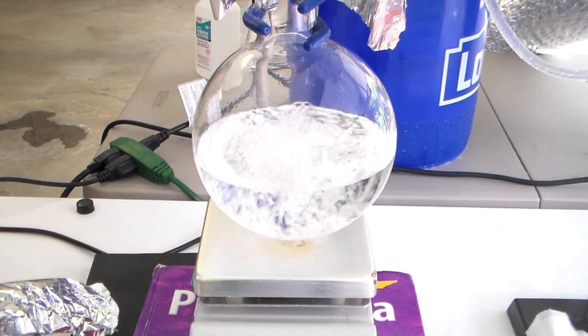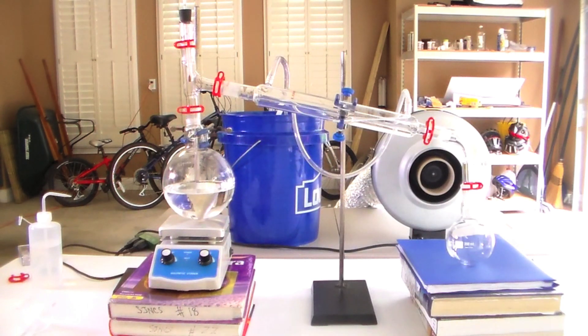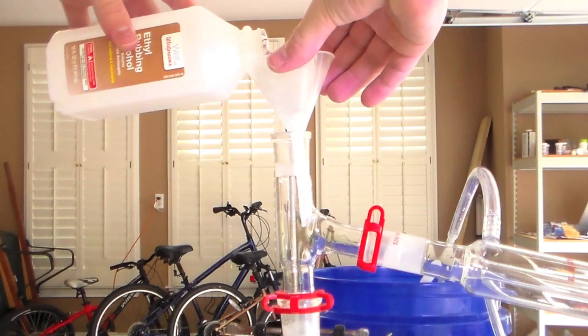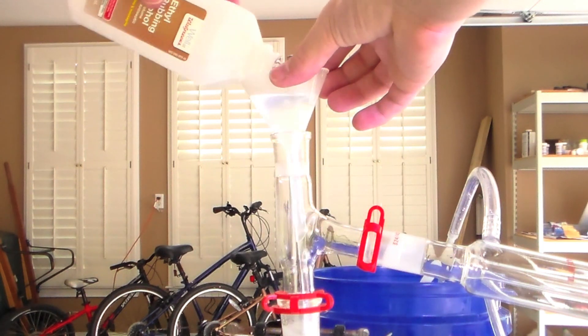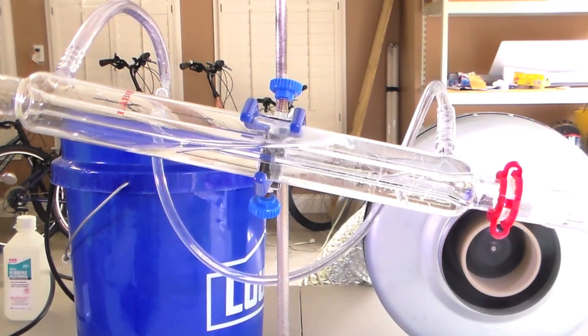The first step is to concentrate the ethanol to about 85%. This can be done with a simple distillation. Charge the round bottom flask with the rubbing alcohol and set up for simple distillation. Make sure you have cold water flowing through the condenser.